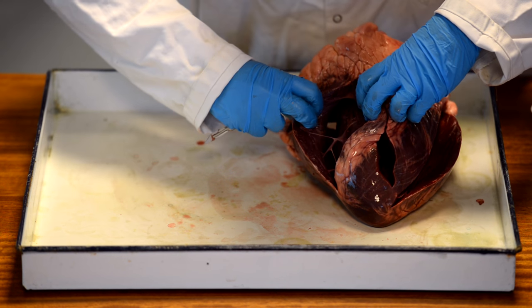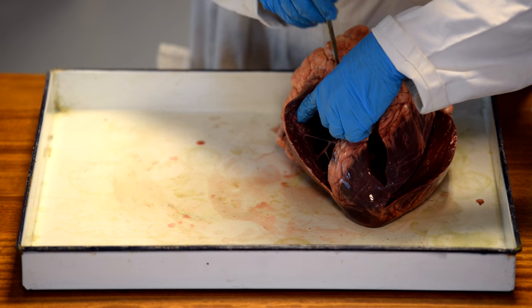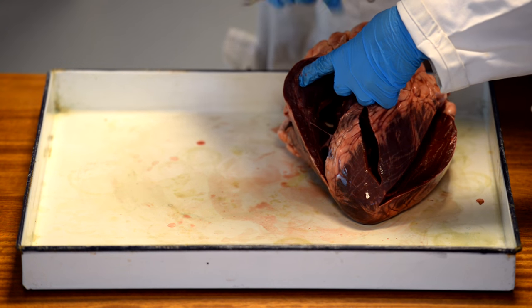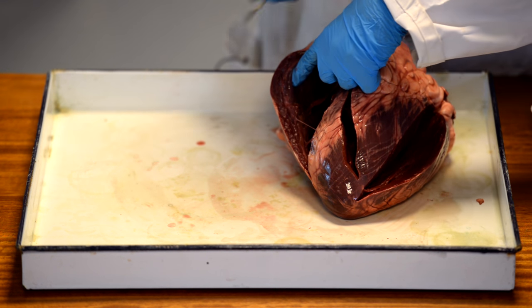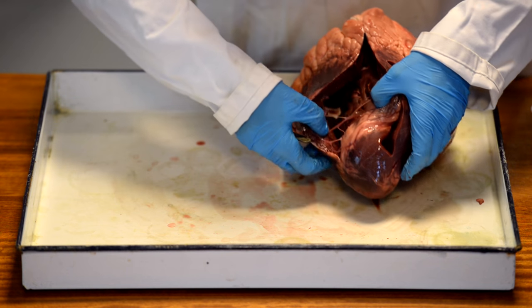Still with these nice gentle brush strokes with the scalpel. You don't want to hack. You don't want to put the scalpel straight in. You want to gently cut away. So you are gently opening the heart. You are not really doing it too much damage. If you just go piling in, you're not going to see anything when you get in there.